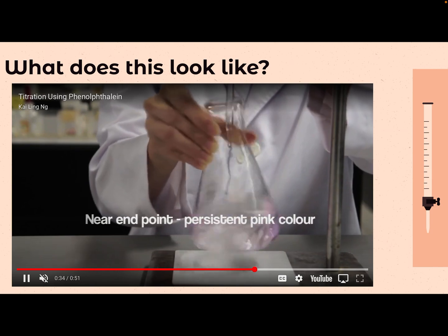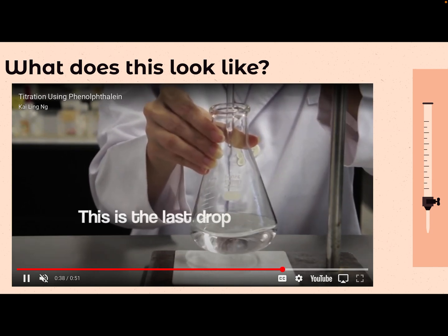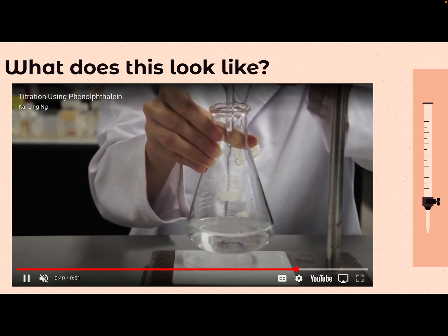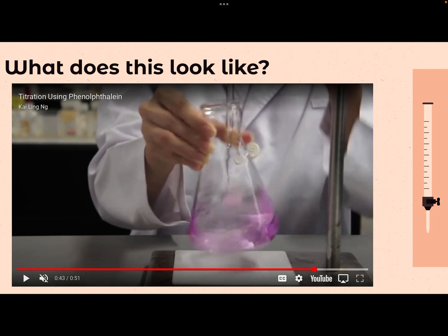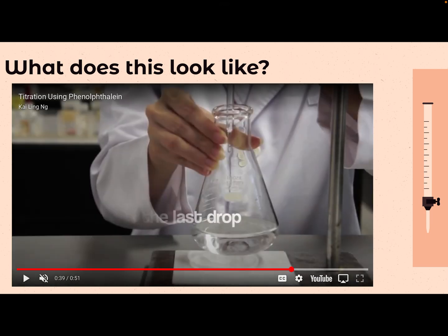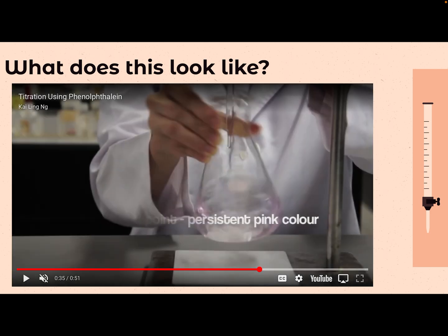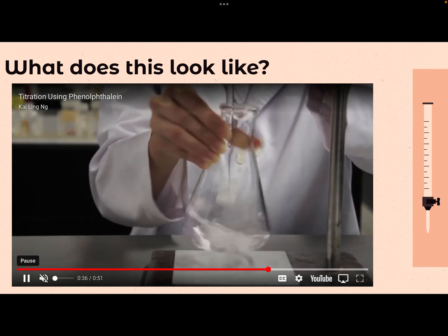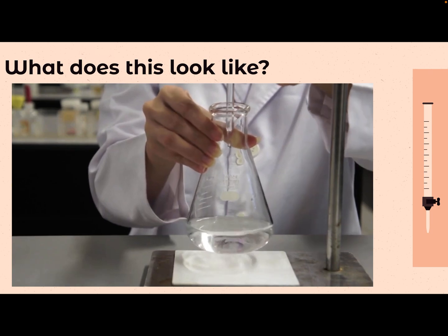As you get closer and closer to the end point of your titration, meaning your neutral point, your pink color will start to stay around a little bit longer. So that's what she was talking about. Let's see if I can rewind this just a little bit. So right here, this pink color is persisting a little bit longer before it goes back to being colorless.